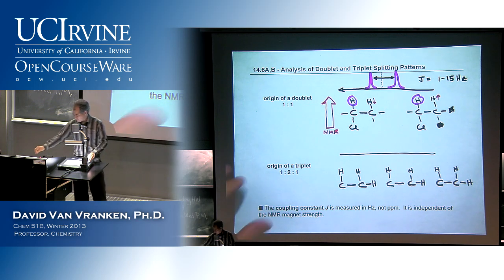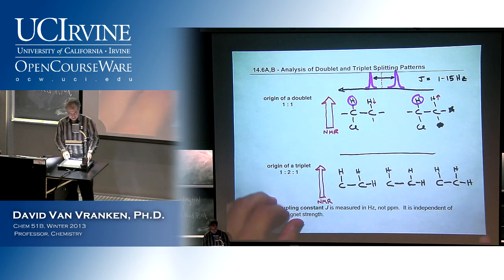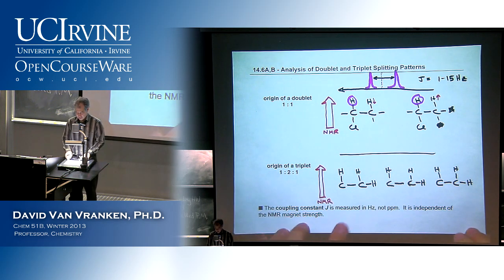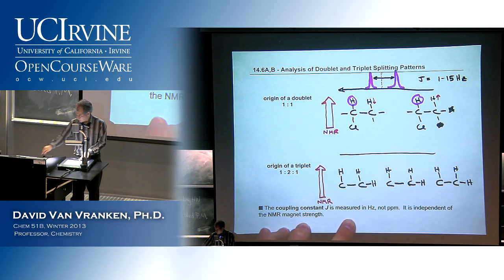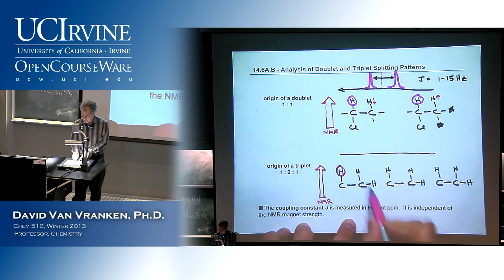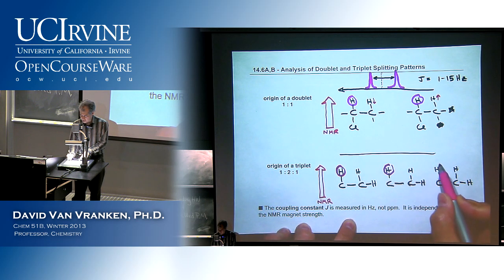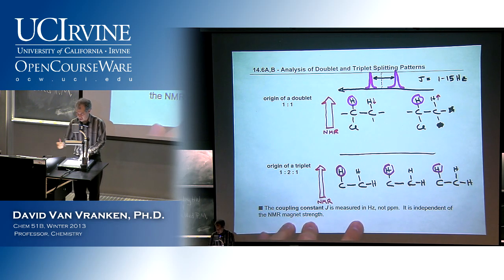So once again, let's imagine that we're in this huge magnetic field created by the NMR magnet. I think physicists use some sort of symbol like B naught to represent the strength of the magnetic field. And I'm not that sophisticated. Okay, so here's the proton. Let me circle the proton that we're looking at. So we're really interested in what's the chemical shift of this? It's going to be affected by its neighbors. And let's take a look at the possibilities as we look at the various molecules in our collection of zillions of molecules spinning and tumbling around.